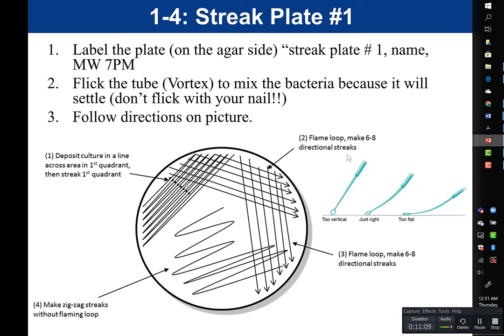After picking up the broth on your loop, draw one line down — this occupies about a quarter to a third of the plate. Then go side to side, back and forth, filling in that entire area to create what's called a lawn. You want that area so filled in that you don't see any individual colonies — just a big mat of bacteria in that quadrant. One line down, then zigzag side to side, going up and down.